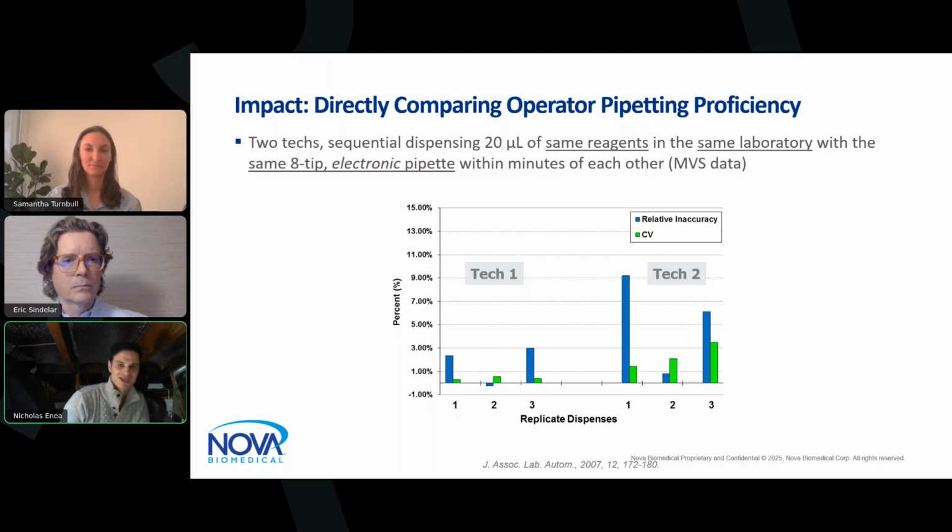If people aren't calibrated and optimized, then you're not even going to be able to optimize liquid classes once you get to a liquid handler, because you're going to be chasing a target that's always moving. So these are things to think about when we talk about optimization. There's the liquid class optimization, which Eric and Sam went over really well and in a lot of detail. But then there's the global optimization from site to site, person to person, and the method transfer process as well.